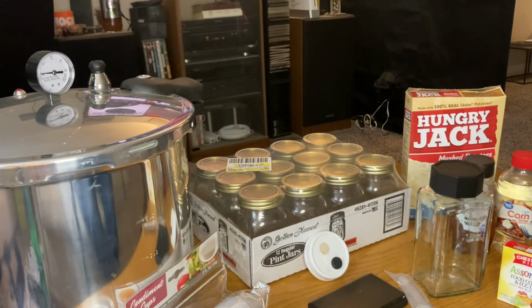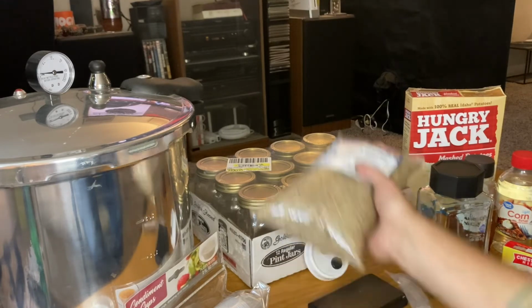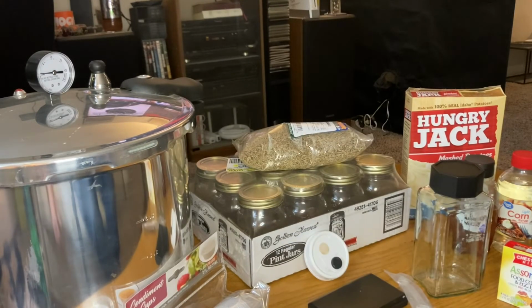From there, you just soak them for a while, cook them a little bit, and then pressure cook them. And we will go through all that as well. But these are definitely some supplies you'll want, so I wanted to go through that.